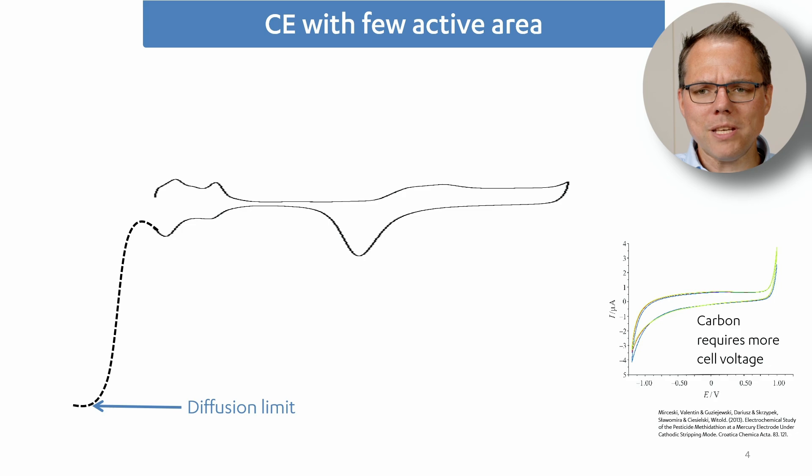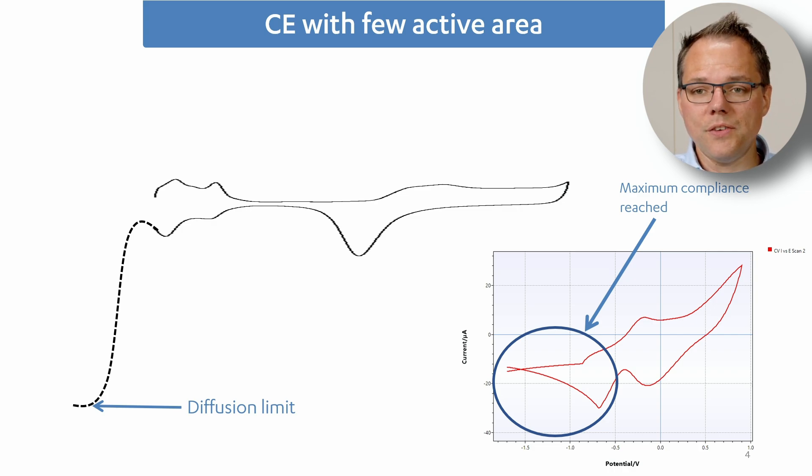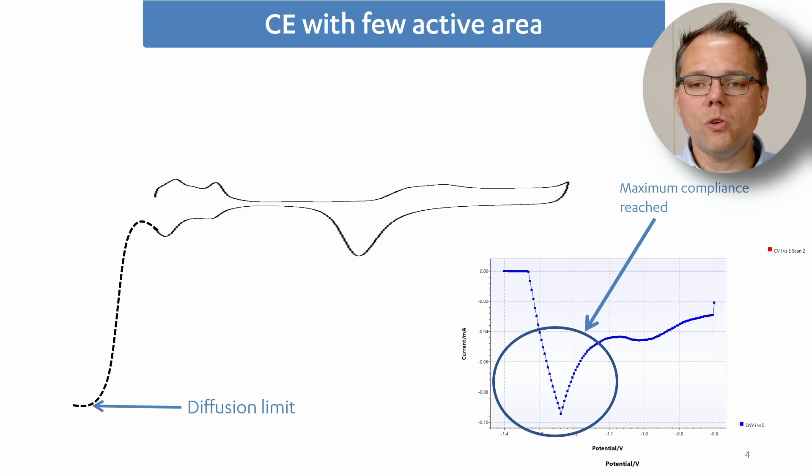How does that look in your measurements? Well, in a CV often you see a very sharp peak and suddenly a rather noisy curve happening there. In a DPV it looks different. There suddenly your current drops to zero. Why is that?